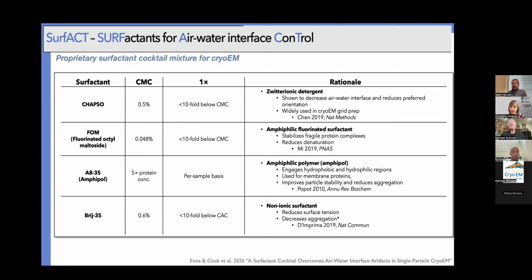And so you don't really need to get super ultra high density for these to work, but it does help for throughput. You don't need lots of particles, you just need good particles. One of the dropouts that we did, we collected 200 movies of our HH trimer and had 8,000 particles, and it went to 2.5 angstroms. And so you don't need a ton of particles, you just need good viewing distribution and high quality particles.